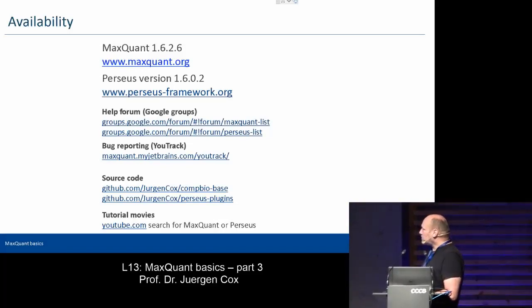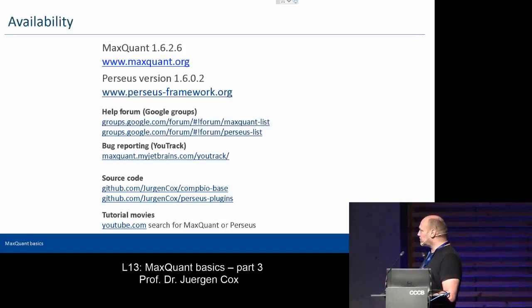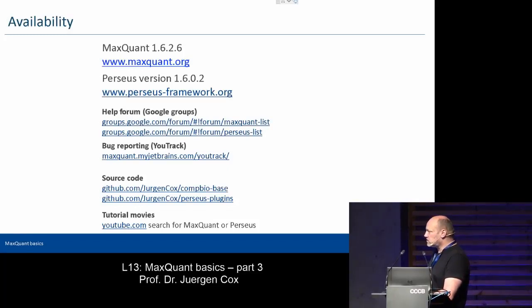So in general, it's not completely open source. We have more the idea of a local, very focused development team and not so much community development. However, this is also changing. In particular for Perseus activities, we really want some kind of community development effort, which we do through the plugins, which we'll see later in this week.